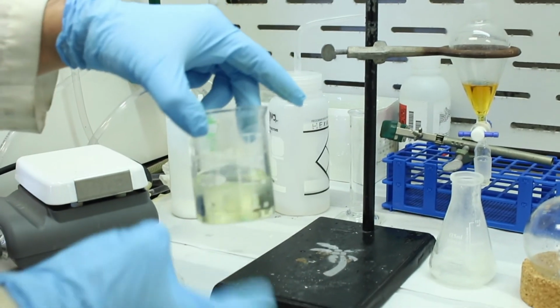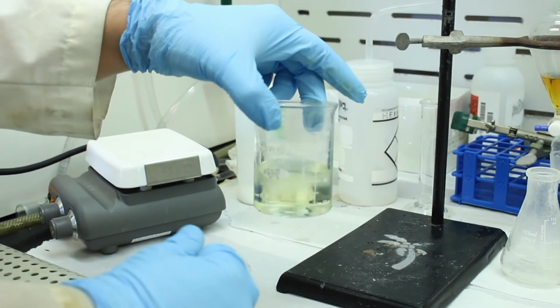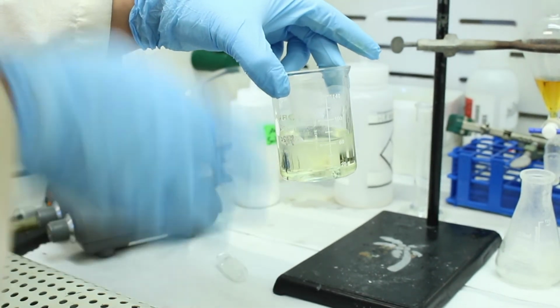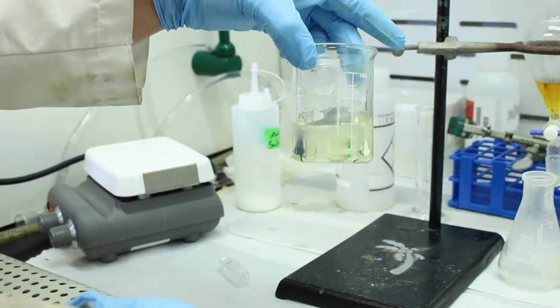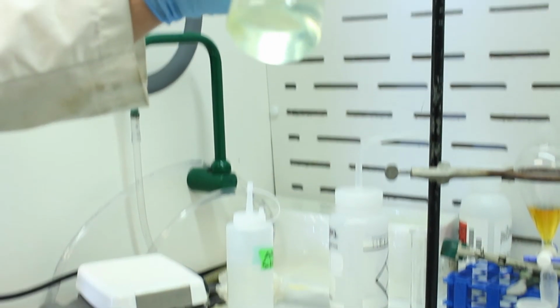So as we boil this away, we're going to put this on a hot plate. As this boils away, the concentration of ether will decrease and the concentration of hexane will increase. So as the concentration of ether goes down, the triphenylmethanol will precipitate, which is our target, but the biphenyl should remain dissolved in hexane because biphenyl likes to dissolve in hexane.